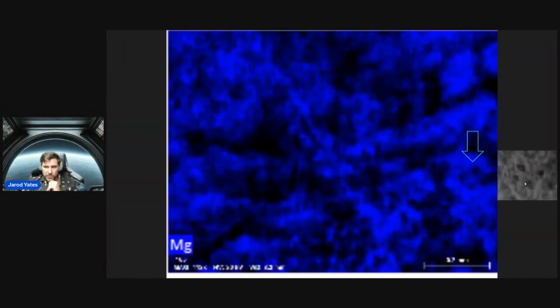Going back to those little arranged spots on the edge that I talked about towards the beginning, here in the magnesium, you can see we have a similar arrangement of those holes there. It's kind of weird. We're finding similar morphologies in completely different places that seem to suggest some kind of potentially purposeful arrangement or purposeful manufacturing. Also kind of weird is you see some straight lines going on. Like I just said, pay attention when you see straight lines.